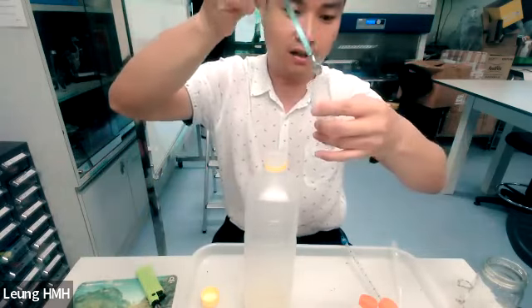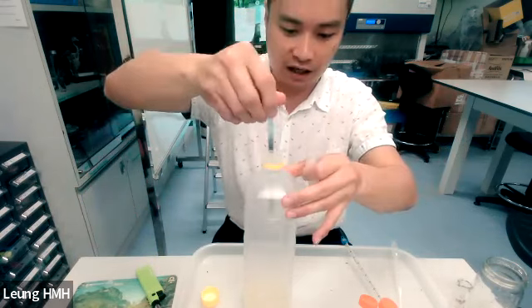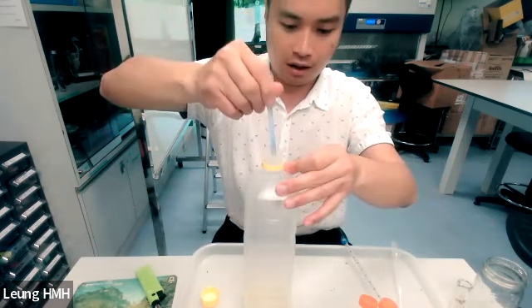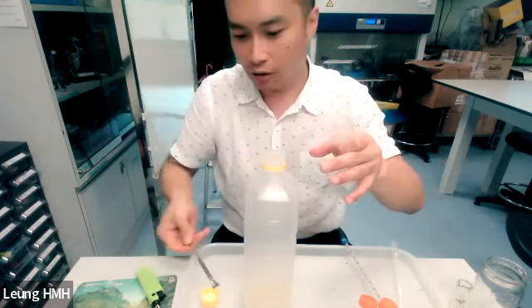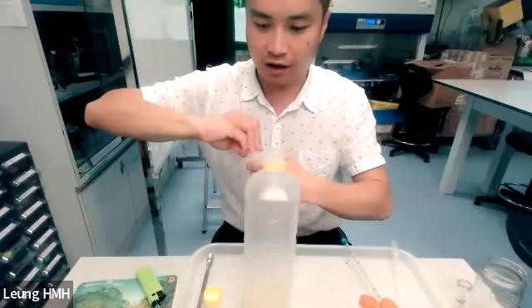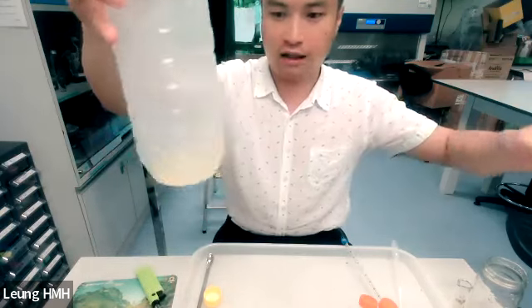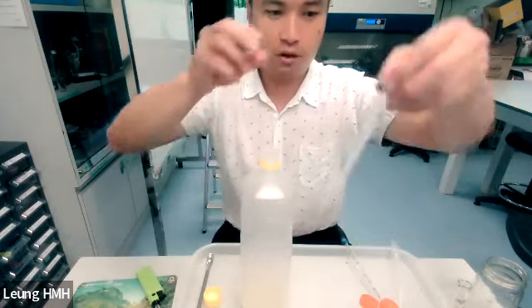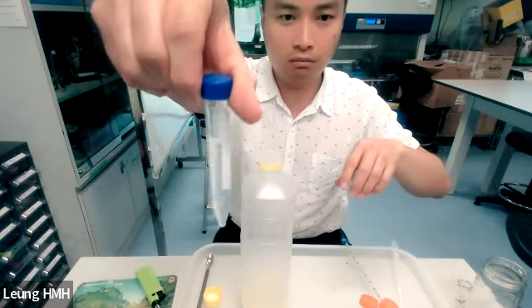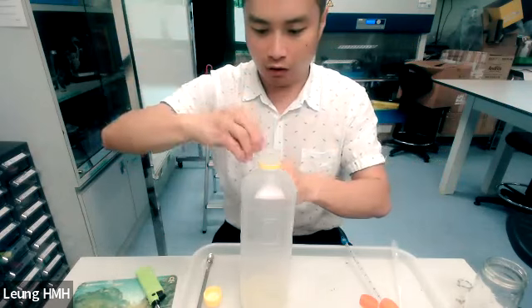We need to add a catalyst, and the amount doesn't matter. The amount of catalyst is approximately the same. It is not important, and not a critical point to affect the experiment. So I try to add the catalyst here. Okay, so we try to add methanol. I measured it before, right? The volume is 10 ml of methanol.